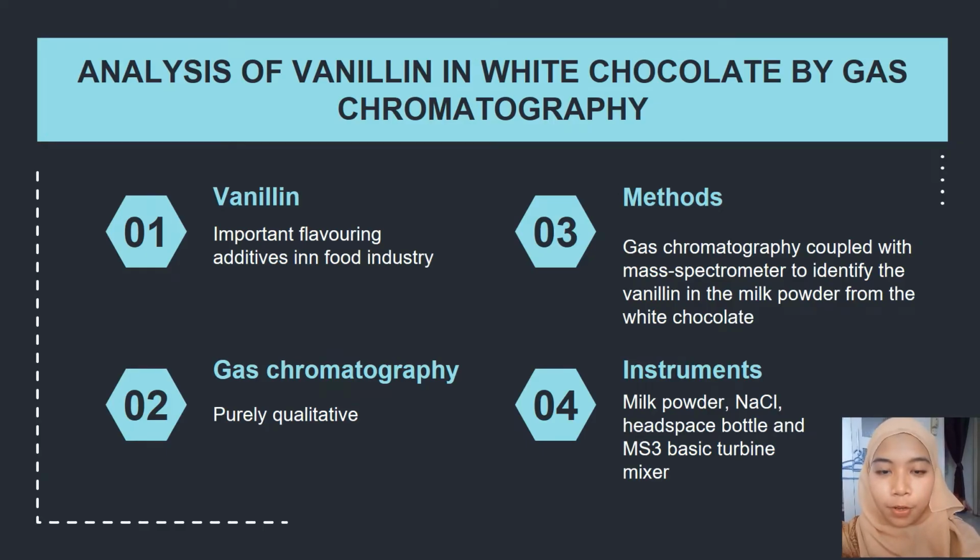Assalamualaikum warahmatullahi wabarakatuh. In this video, we are going to present our case study of the analysis of vanillin in white chocolate by gas chromatography. I am Yasmin Adriana and I am going to give a brief introduction for this case study.